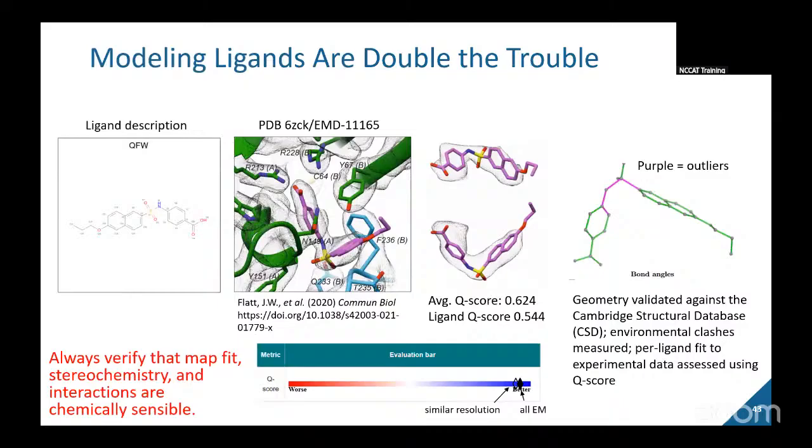And so the last thing I'll do here, I think I've managed to pack as much as I can into 1 hour, is to give some insights about ligands. I think that's one of the really cool areas of cryo-EM right now, and it turns out it's super hard to find an optimal pose that satisfies both fit to map and coordinate space validation. So to do this, I'll use some of my previous work.